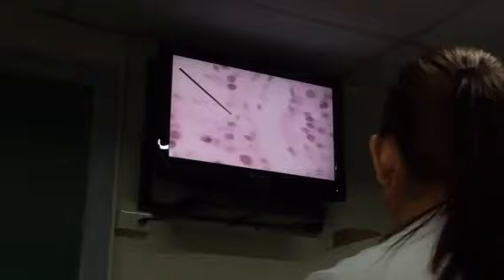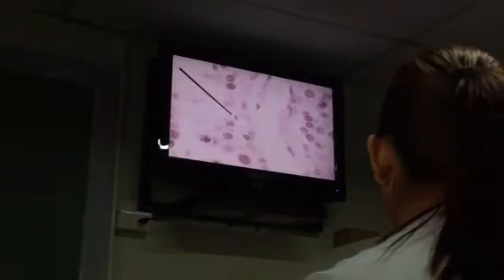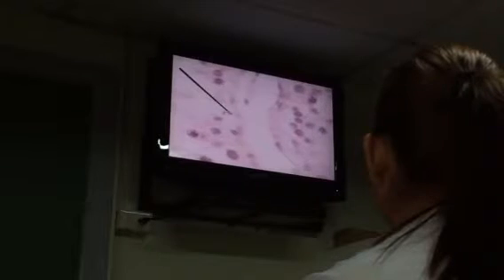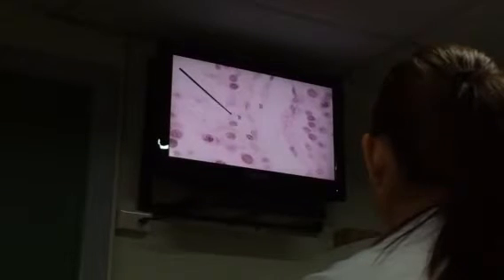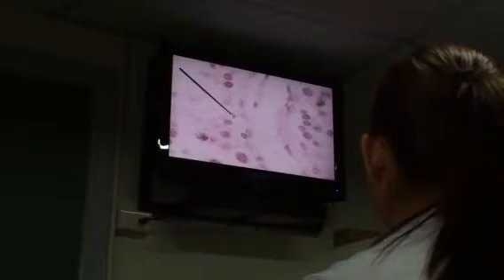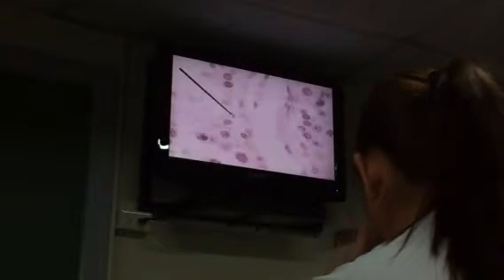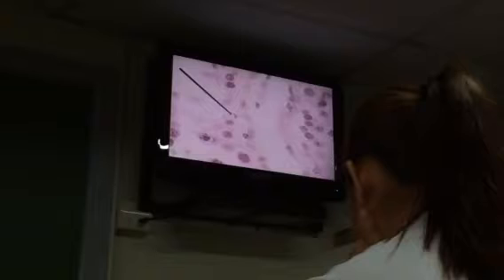We now see a grain-like structure like this. No? This will now be your spermatozoa. Okay? So, zoa po, yung pong manipis, small structure. Grain-like structure, that will be your spermatozoa.